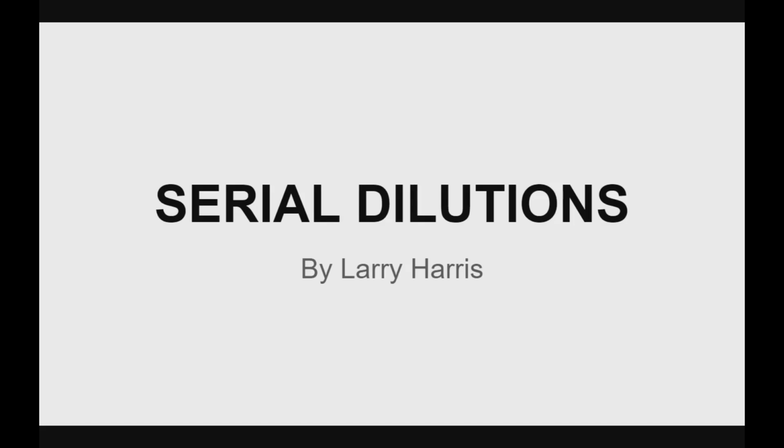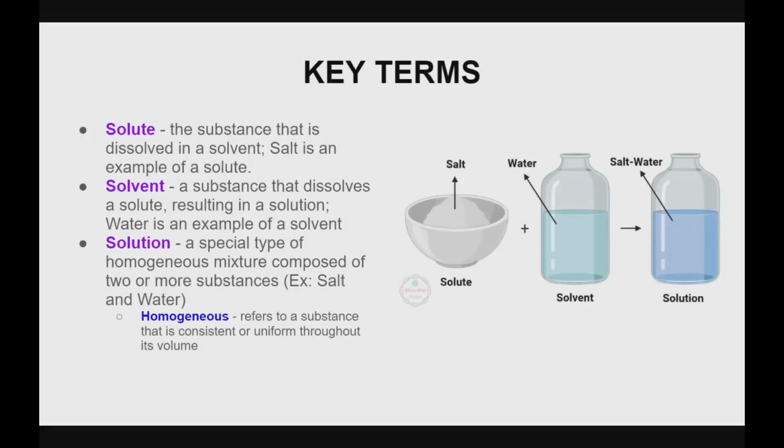Okay, in this lecture, we're going to talk about serial dilutions. So before we start, let's talk about some key terms. First term I want to talk about is solute. And solute is a substance that is dissolved in a solvent.